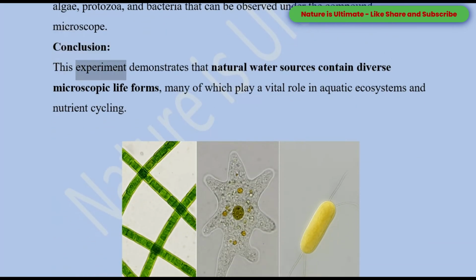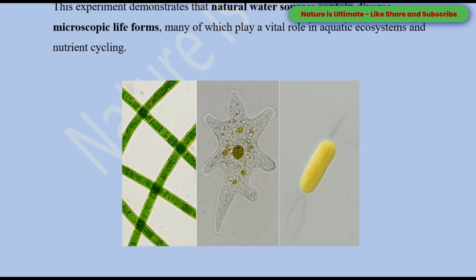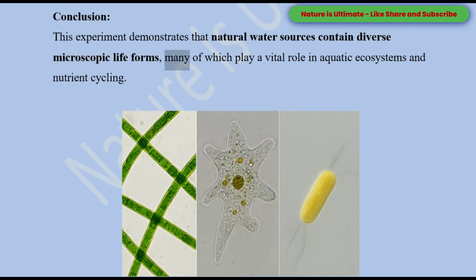Conclusion: This experiment demonstrates that natural water sources contain diverse microscopic life forms, many of which play a vital role in aquatic ecosystems and nutrient cycling.